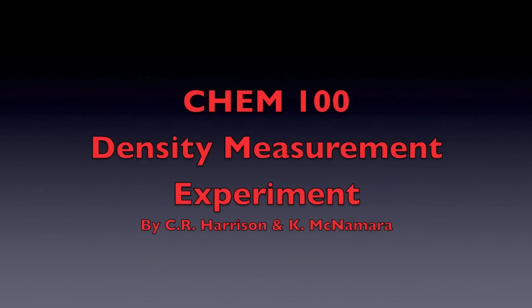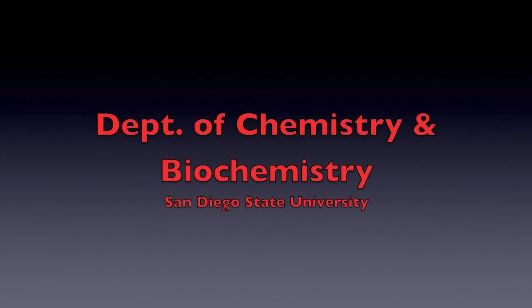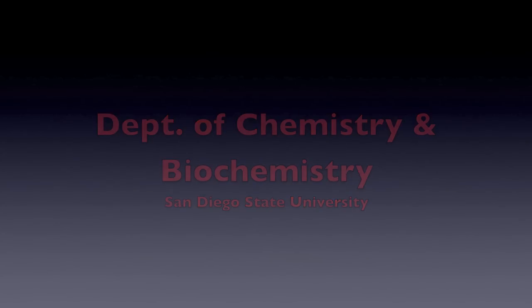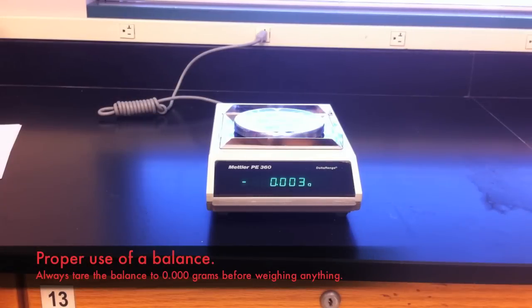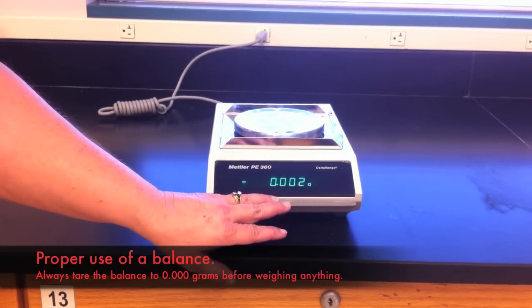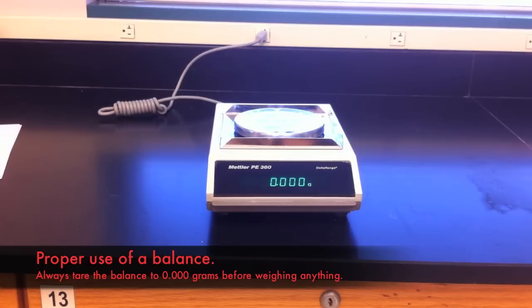In this lab we're going to investigate how you can measure the density of a variety of solids and liquids. The first thing you'll do is properly set and tare the balance by setting the value to zero, just simply tapping the main bar, and you need it to go to zero in order to accurately measure any mass that you are using.